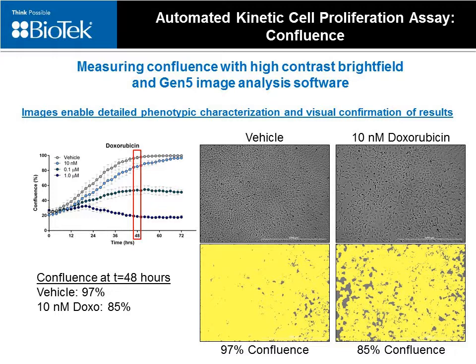So this means that the actual inhibitory effect on cell growth, on the overall cell population size caused by this treatment, is likely even greater than is represented by the 12% or so difference in confluence. Therefore, these images provide not only a window into the underlying biology, but also allow researchers to identify potentially confounding conditions, providing greater confidence in the assay results compared to alternative methods that are less transparent.